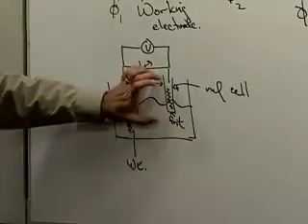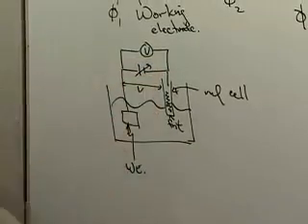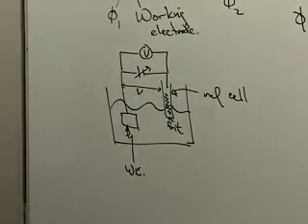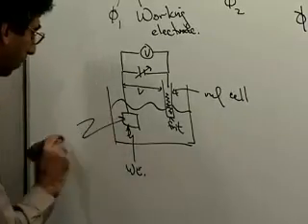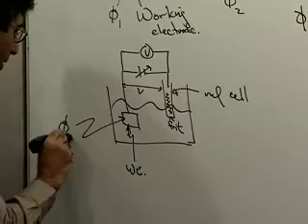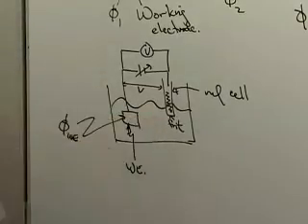Okay, so if I know the potential of this on some scale, and I can know that because I could look it up in terms of standard redox potentials, then I can say, okay, the potential of this electrode, my working electrode, is just X volts versus my standard reference cell.